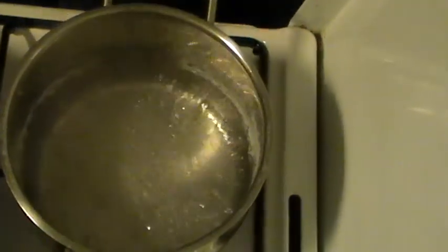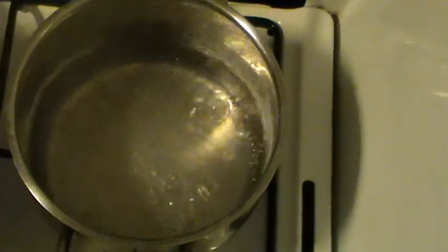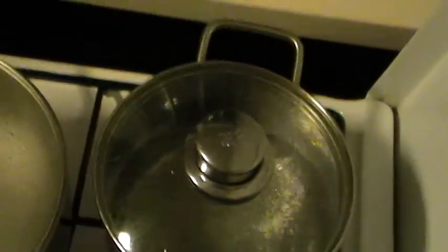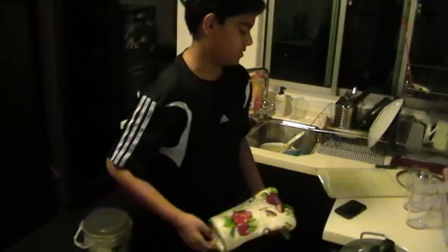Still not even as vigorous as the boiling of the pure water. So this really proves our point. Our hypothesis is correct, and fresh water did boil faster than salt water. Thank you very much.